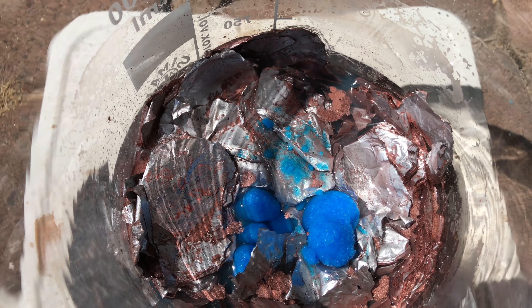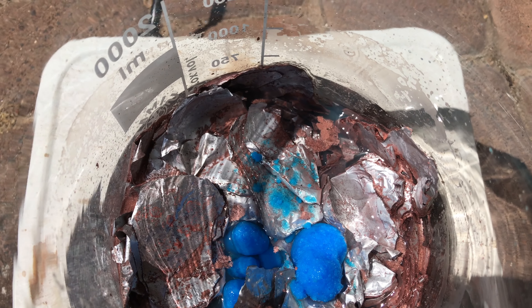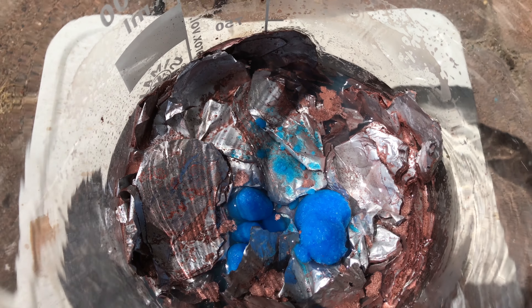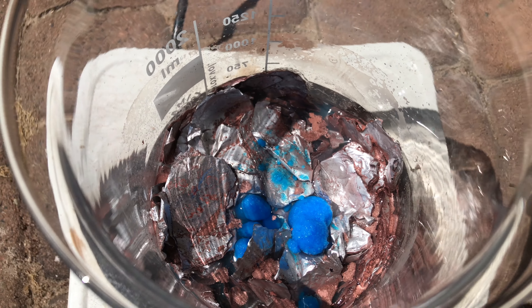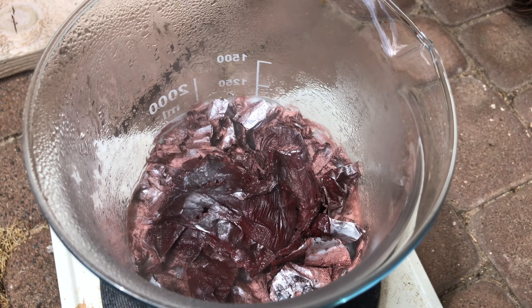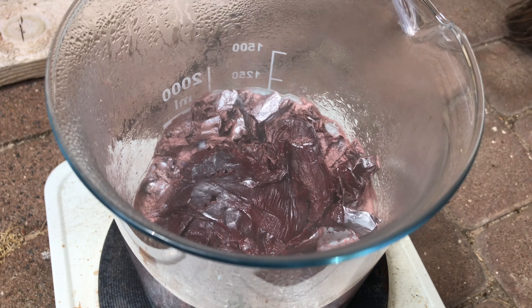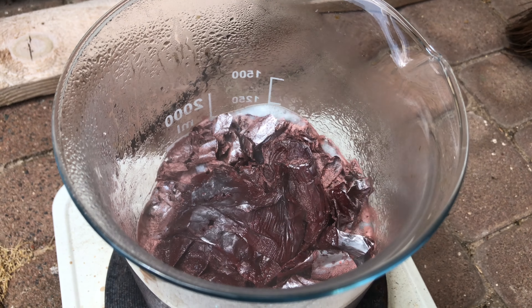I could have used even more until all of the foil disappeared, but I didn't want to because I think it's already enough copper. This copper will be slightly contaminated with mercury, but I used very little mercury and therefore the contamination should be way below 0.01%. To get rid of leftover aluminium foil, hydrochloric acid was added until all of it dissolved.